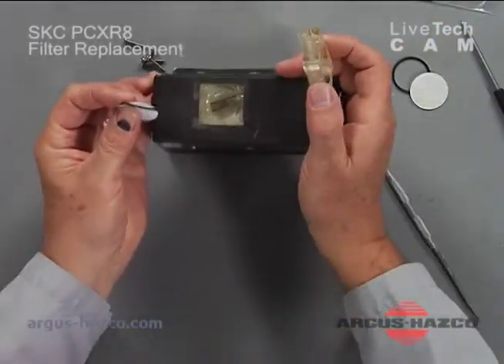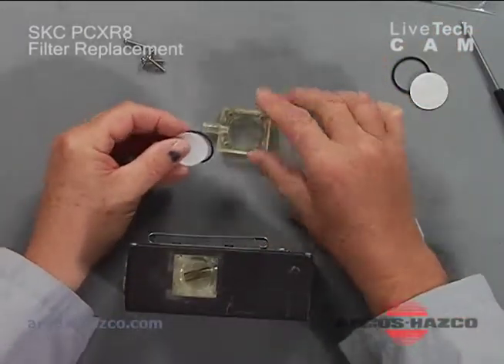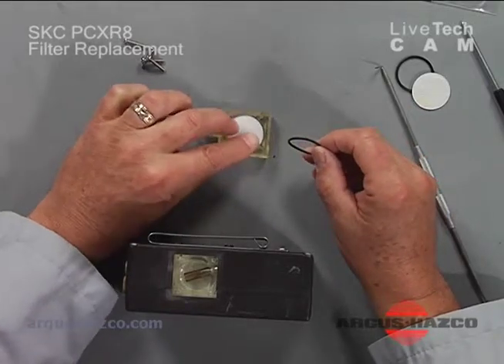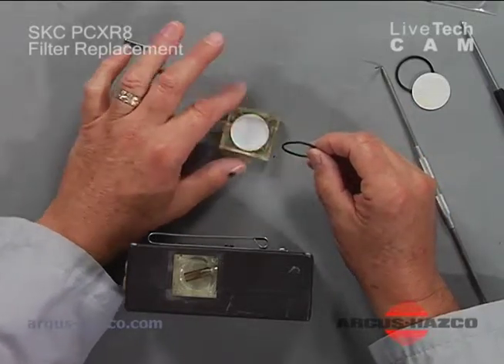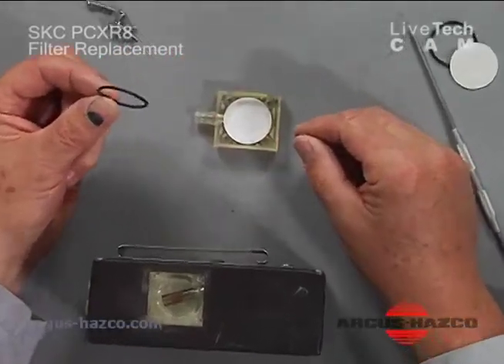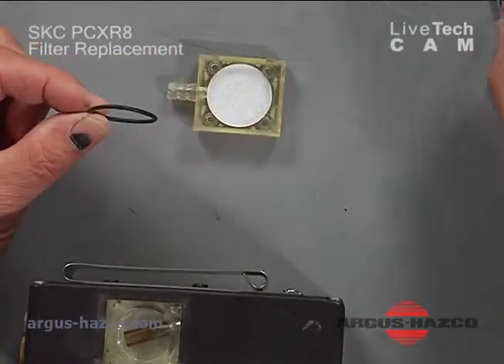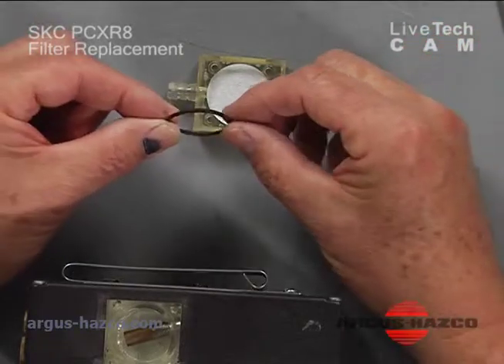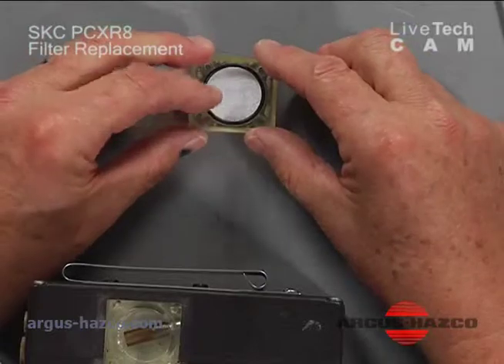Then we have the new filter. The filter will go in first — it seats nice and snugly. Then place the new o-ring on top. If the old o-ring is in good condition you can reinsert that as well, but in this case we have a new o-ring.